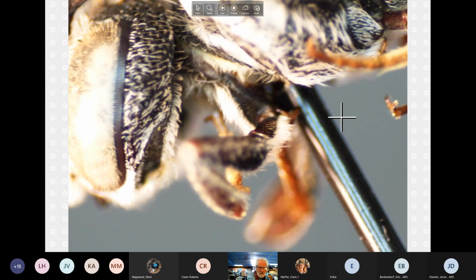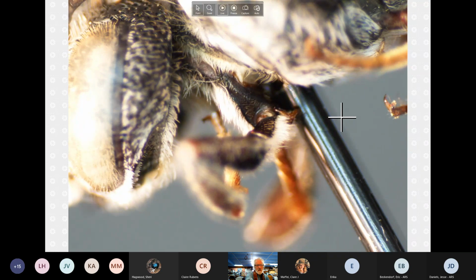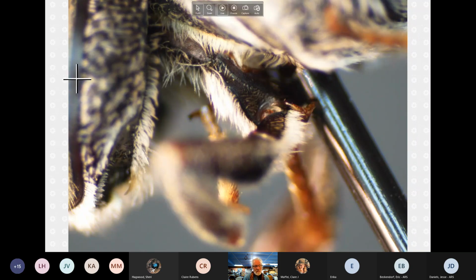Okay. So here, I think I mentioned that these furry strips were at the top, but if you look at them from underneath, they look like they're on the top, but from the upright position on a Coelioxys male, it would be on the bottom of this thing. So here is the eyeball, edge of the eyeball is up there. This is the bottom of the head down here. Here are the mandibles out in this direction.